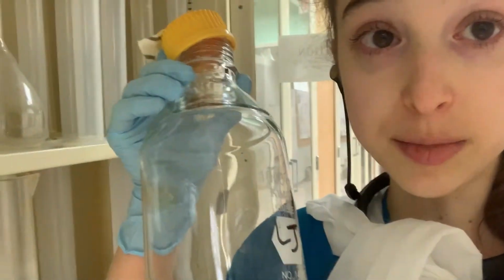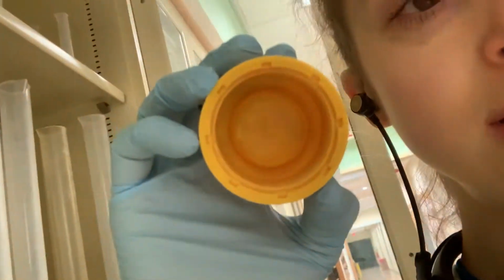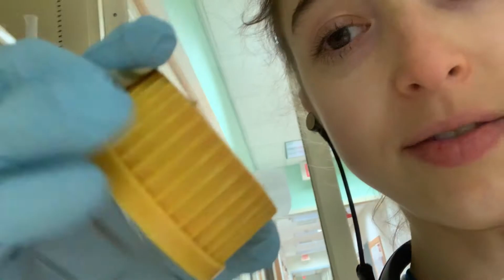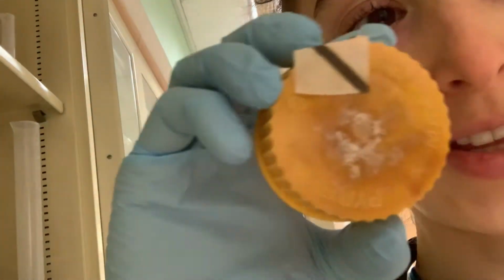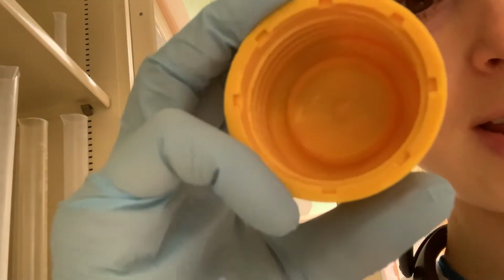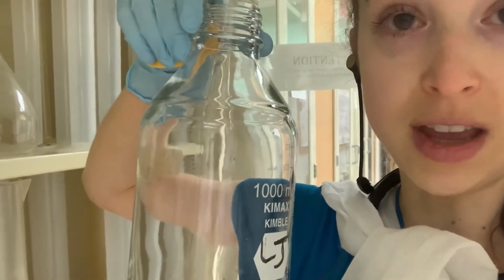With these bottles, there's a couple things you want to keep in mind and be aware of. So first is the cap. When these caps get old, they get autoclaved too many times. So the autoclave is the sterilizer thing. It's this really hot, really high pressure oven thing that sterilizes. And if you do it too many times, these caps can get really crusty, and then this can start flaking off. And if it flakes off into your nicely filtered buffer, then that's going to make you really sad.